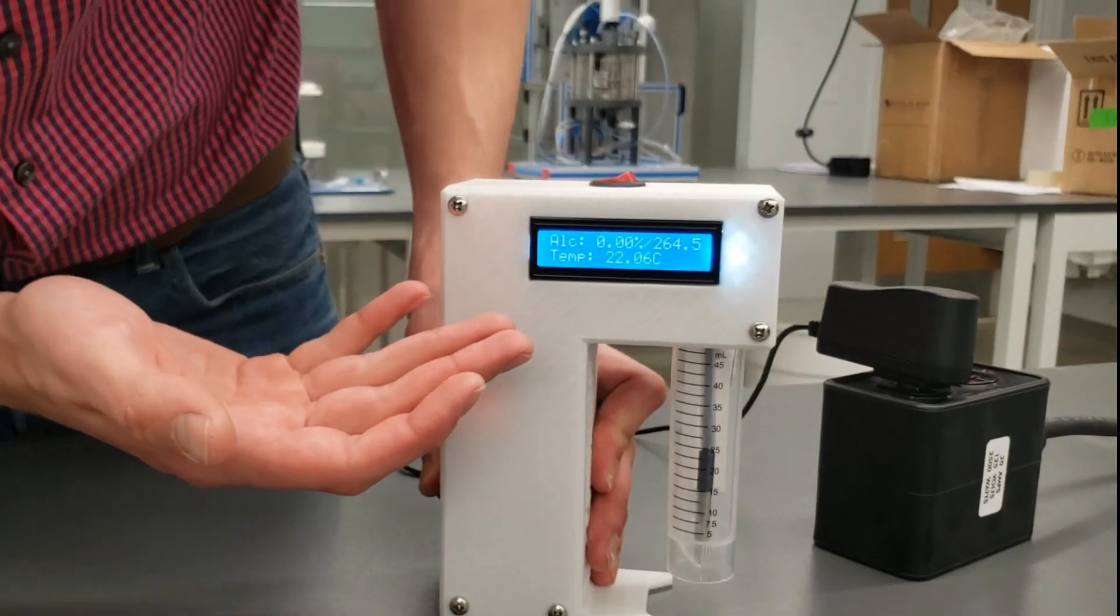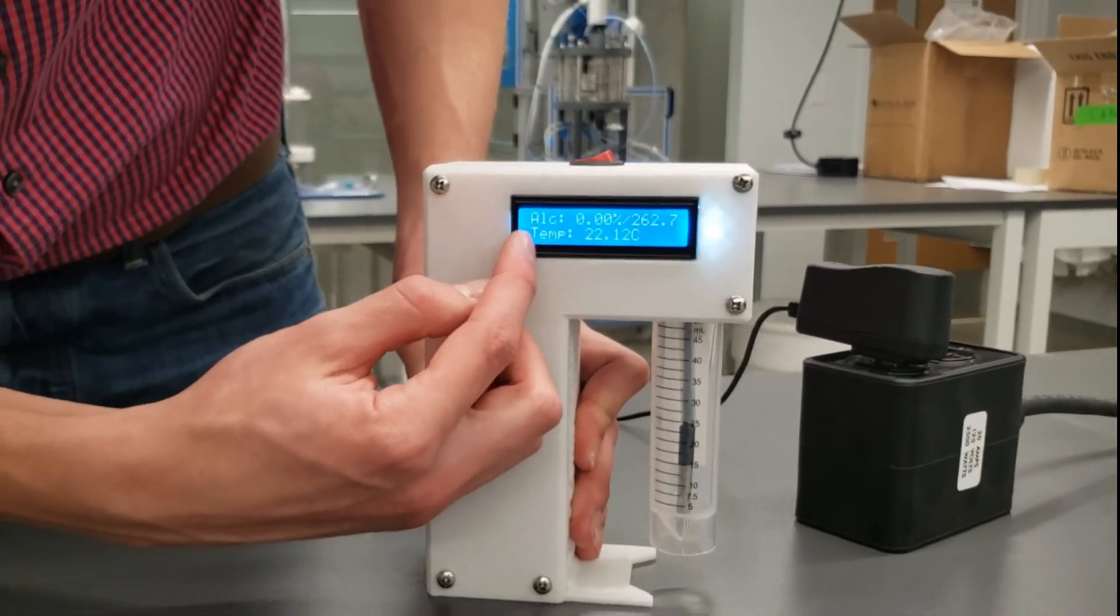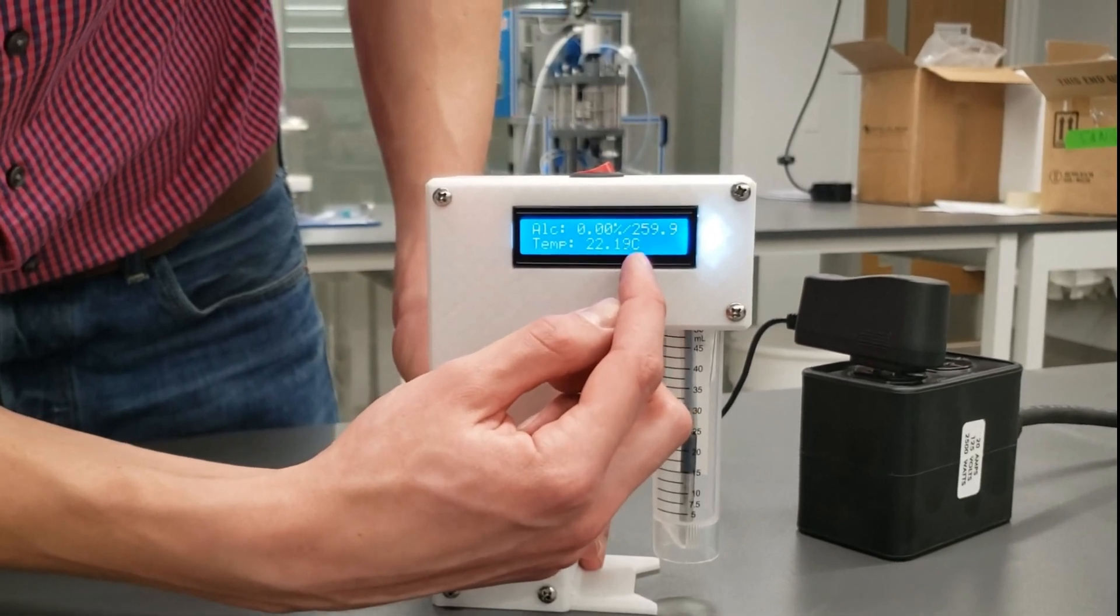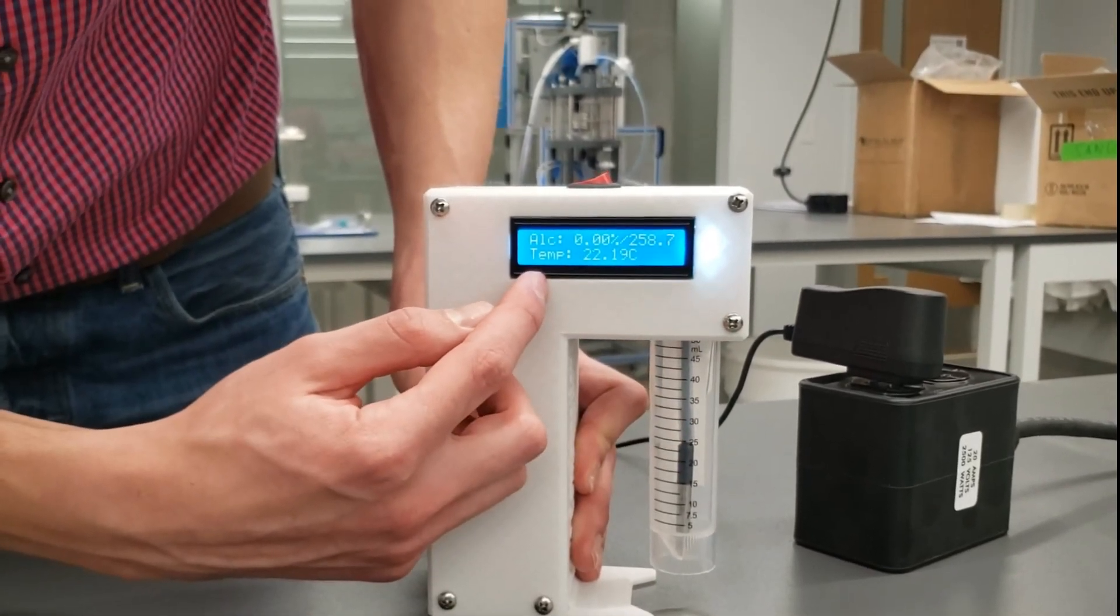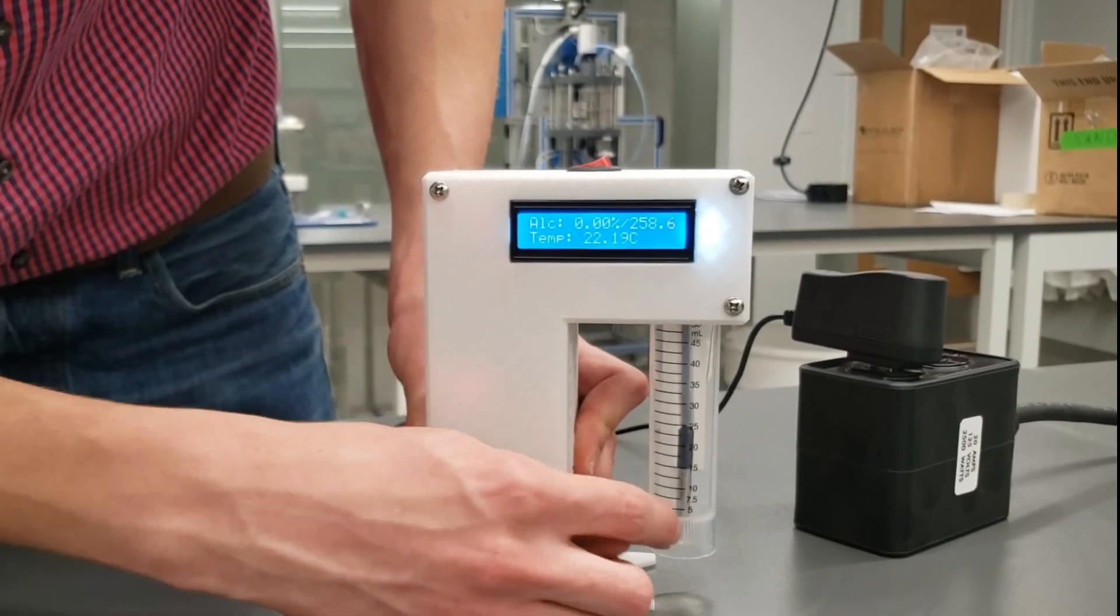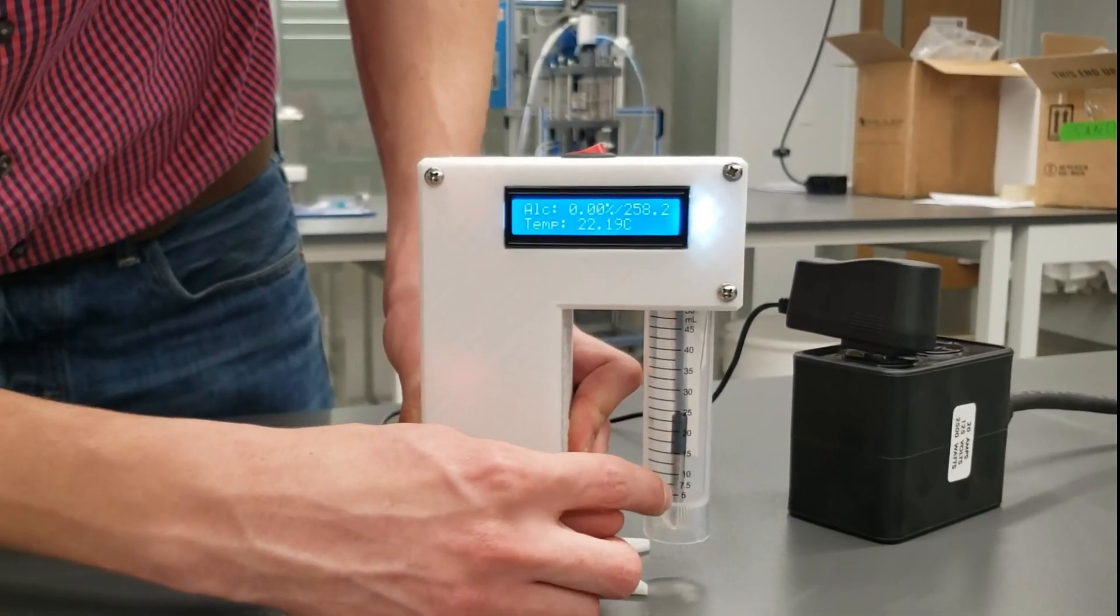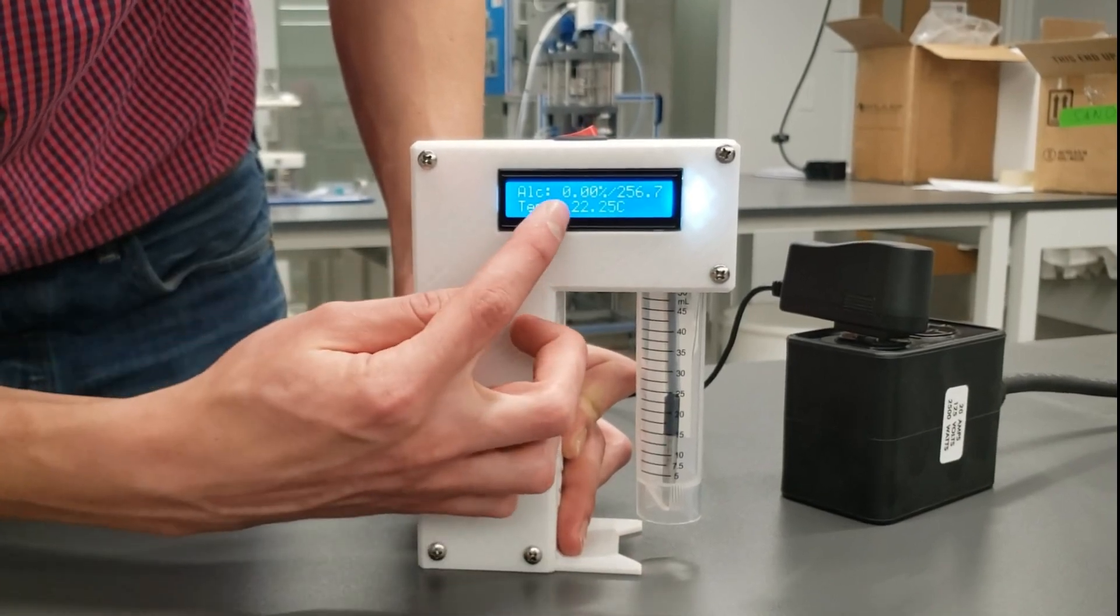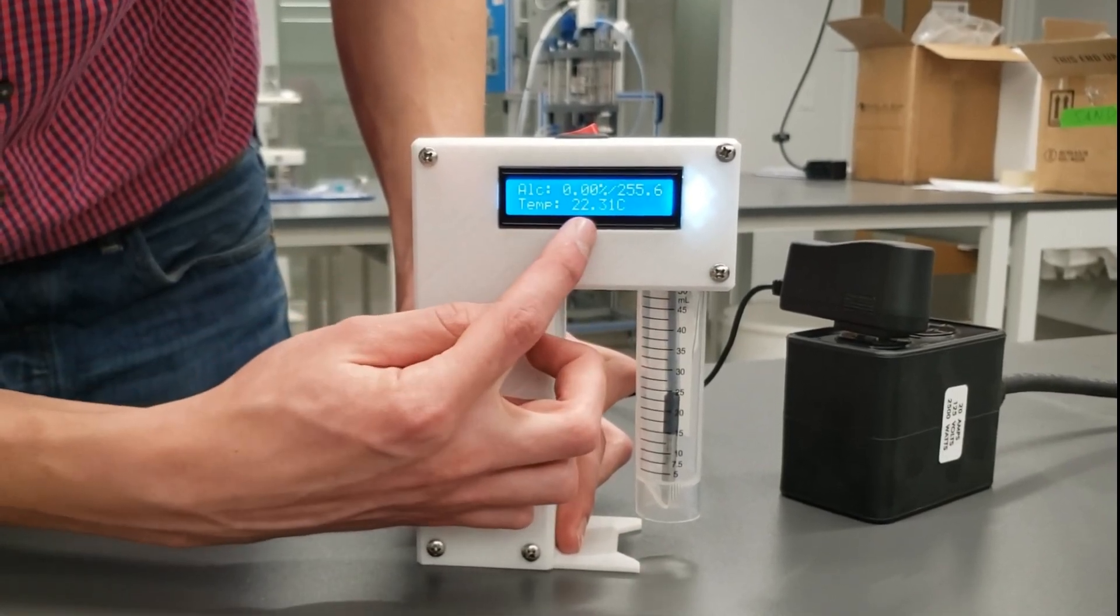Now that the detector is warm you can see that it displays the alcohol percentage and then this raw reading to the right of the percentage. You can also see that it's displaying the temperature of the sample in the sample tube. Now for the simple use case of this detector you'll only be using the alcohol percentage there and the temperature of the sample.